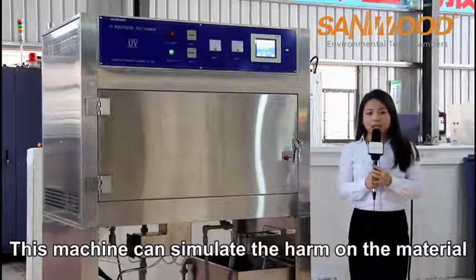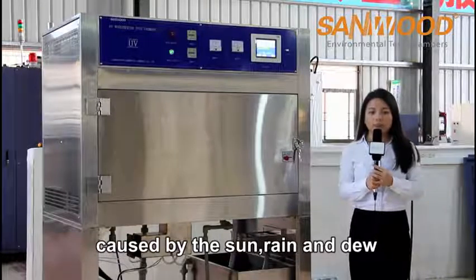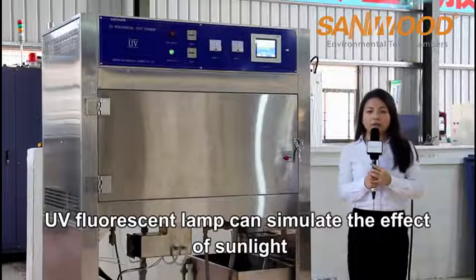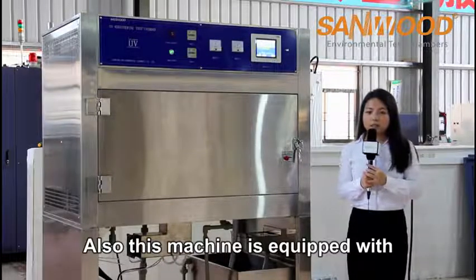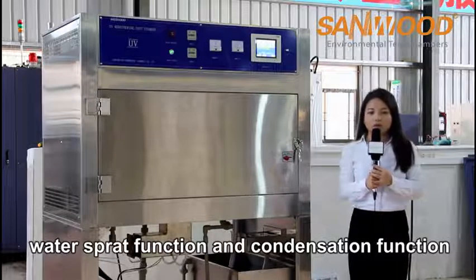This machine can simulate the harm caused to materials by the sun, rain, and dew. UV fluorescent lamps simulate the effect of sunlight, and the machine is also equipped with a water spraying function and condensation function.